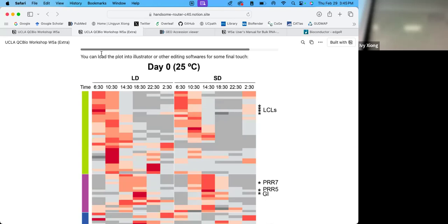Yeah, that's the thing you're using for featureCounts, right? So can I copy each of these into tests? Yes, into tests. How can I copy it from this folder into tests? That's something that I always struggle with. Oh, you can do it, just need to come online, you can do it all in one step. And then just cp, send it to the slash.